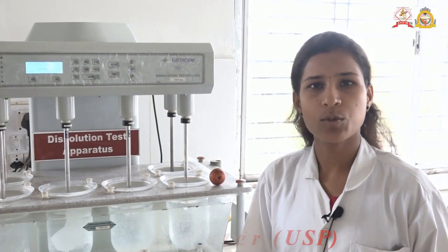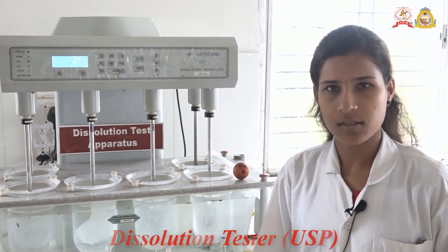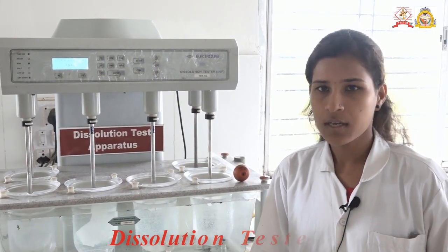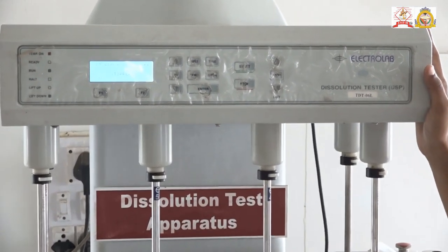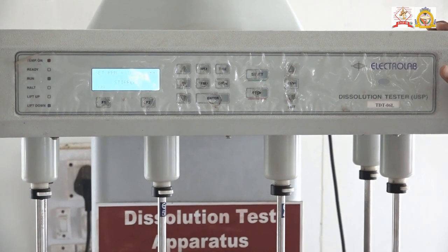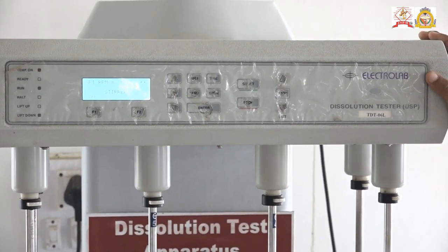Good morning everyone. I am a student of M.Pharmacy from the Department of Pharmaceutics, Rajarshi Shahu College of Pharmacy and Research. Today we are going to see the introduction and working of the USP dissolution tester apparatus made by Electrolab.